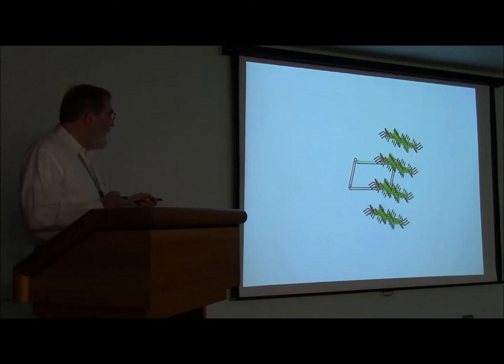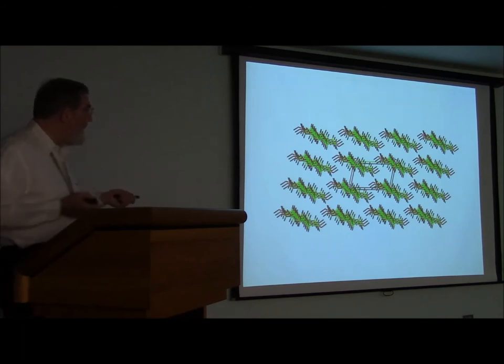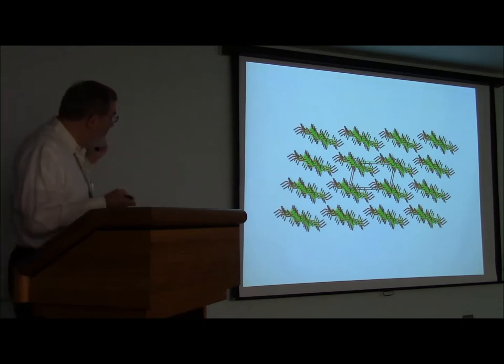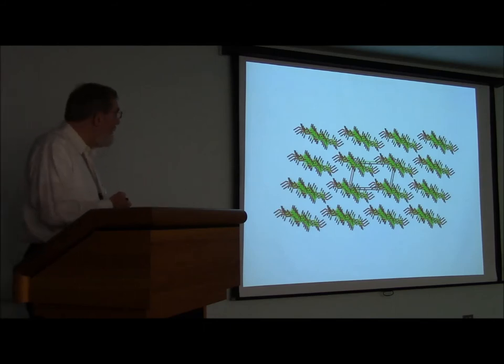And then by just moving along the A-axis in units of the unit cell length, you can generate more of a model crystal here. And then moving along the B-axis in different directions, you see now we have a 16-molecule crystal to look at. And if we got information from the Scherrer formula that this is what size the crystal was, then we'd have a model of what to look at and expect, something that we could understand better.